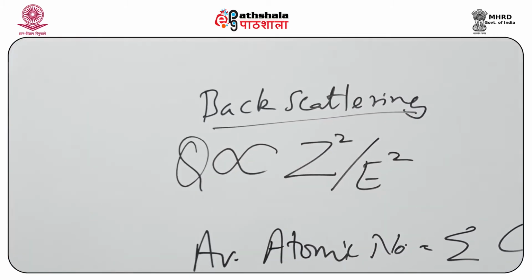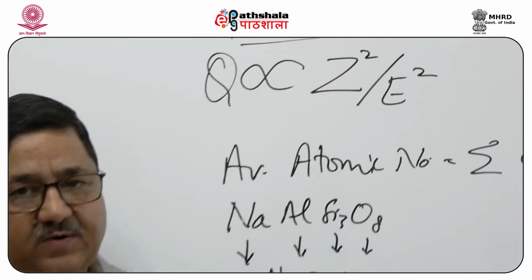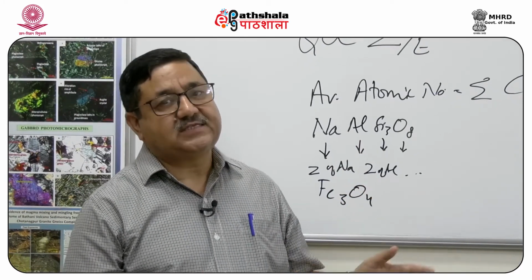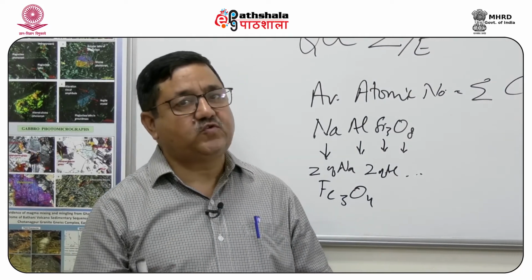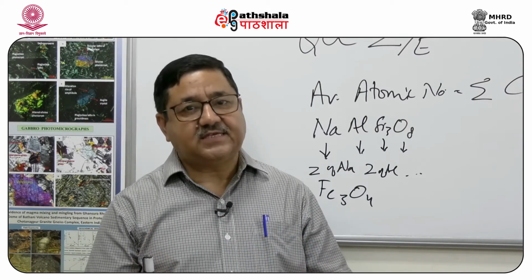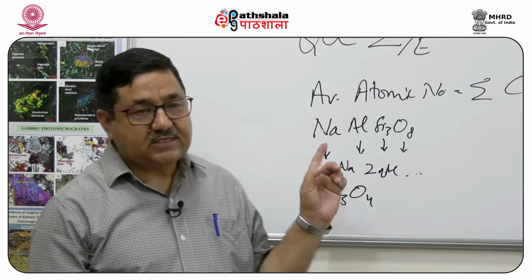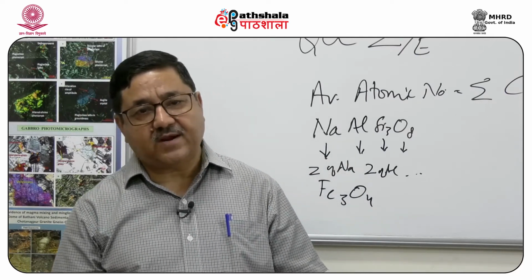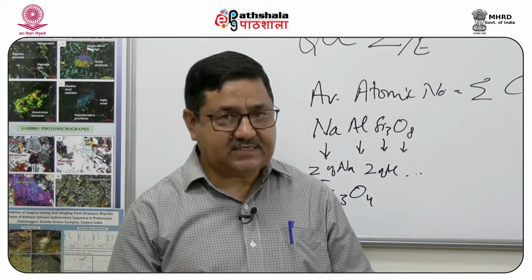And the amount of backscattered electrons in reference to the incident electrons is the backscattering coefficient. So, higher atomic number elements, minerals and compounds have a higher backscattering coefficient, and it is a very useful tool to distinguish petrologically different phases and variation in composition within the different phases. This is one important microscopy function which is obtained through the scanning electron microscope. The other thing which happens is inelastic scattering.